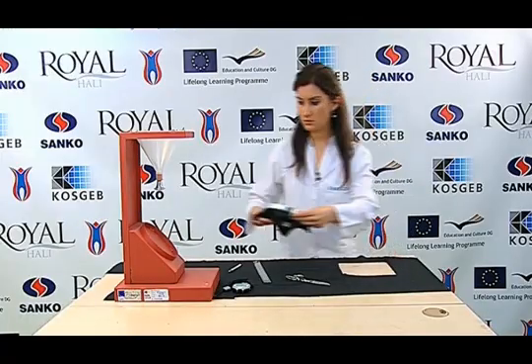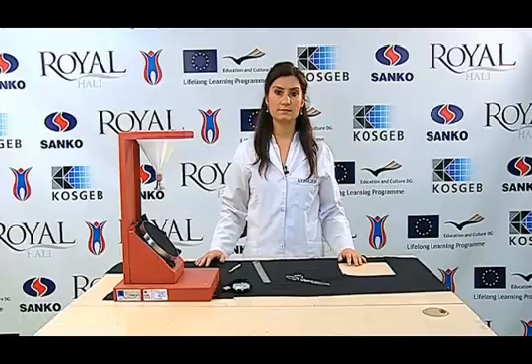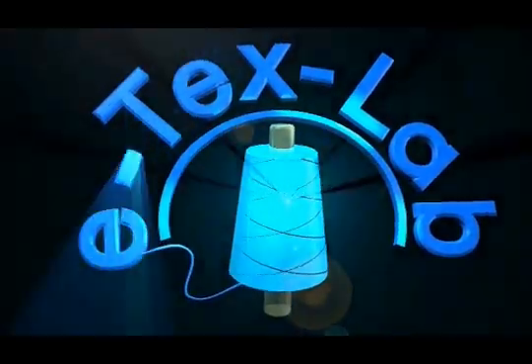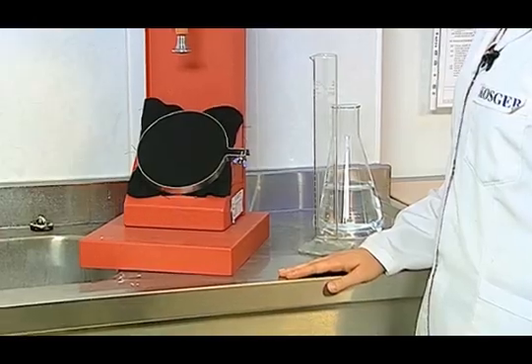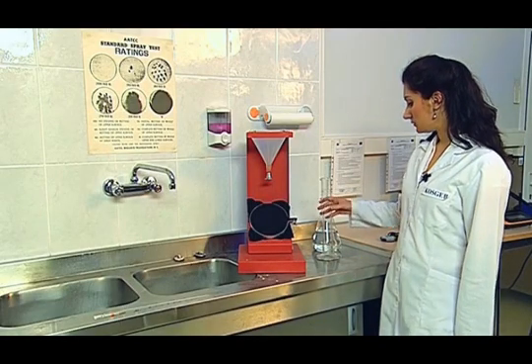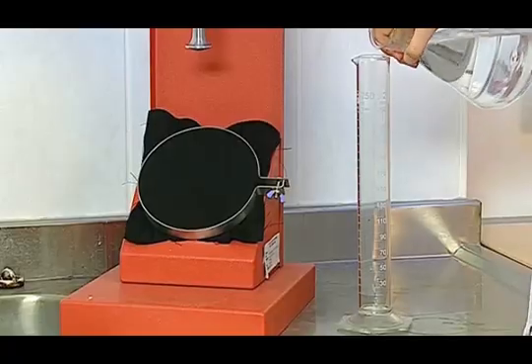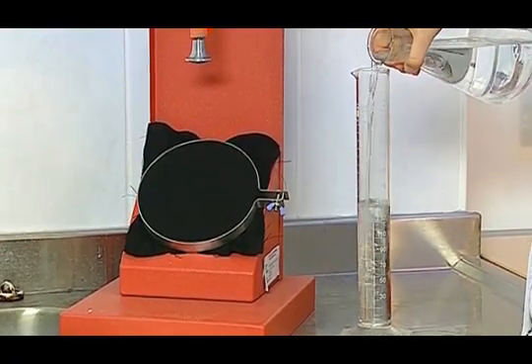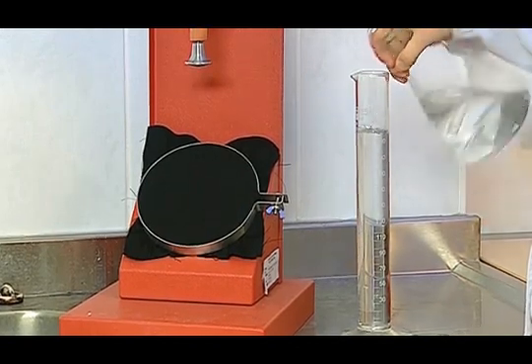We place the holder in its place in the device. Then it is subjected to a spray test. The warp direction of the sample placed in the device should be parallel to the water flow direction. 250 millilitres of pure water are measured by the graduated cylinder.